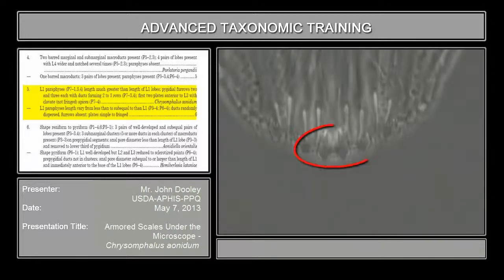You see these sets, and you notice on this particular genus, for the most part, they're at the base of the lobes. There are other genera where if you see something like this, but you see maybe three in between and one coming out of the center between the lobes, that's a different genus. We're not going to go into that because it would cause a lot more confusion at this point.